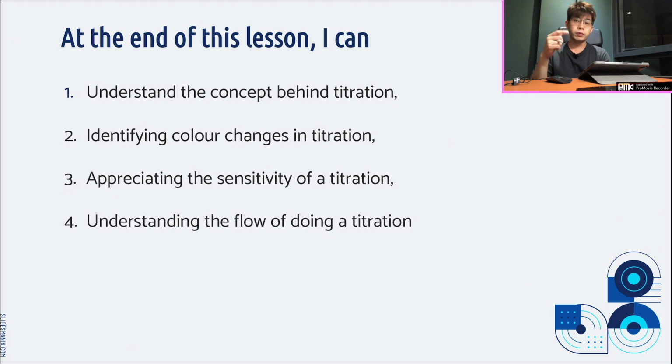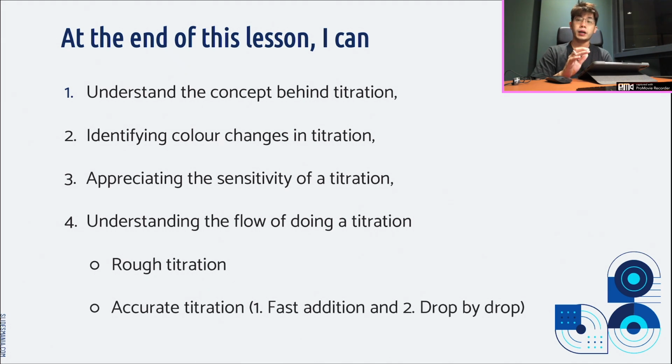Also understand the flow of the different experiments that we need to do in the titration, which includes the rough titration as well as the accurate titration, which can be split into two sections. Firstly, the fast addition, and then followed by the drop-by-drop section.